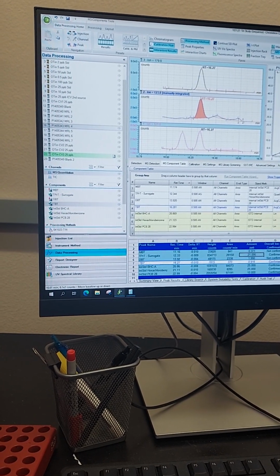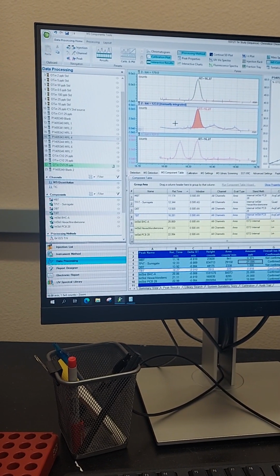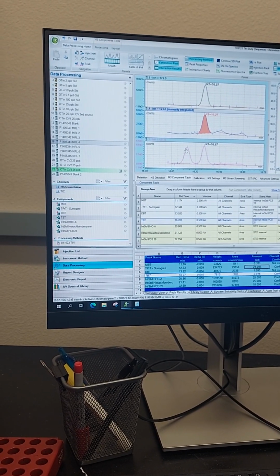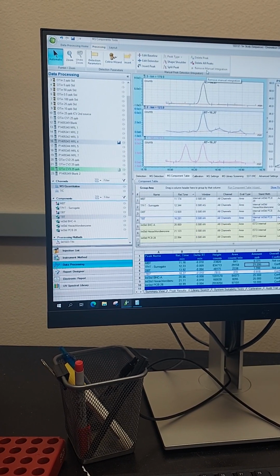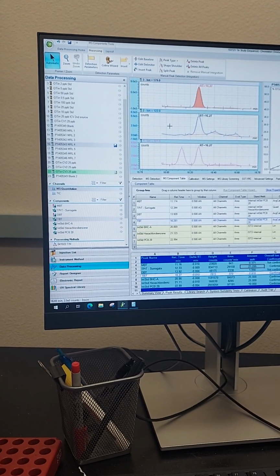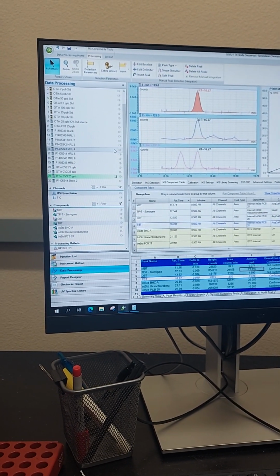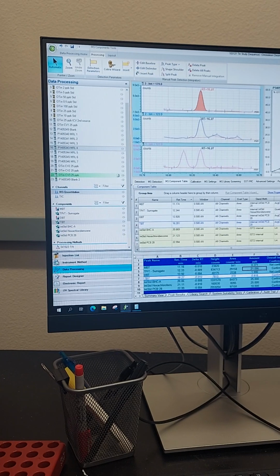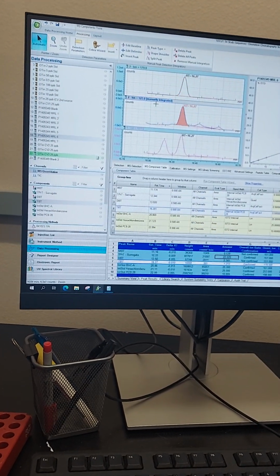I think some of these. Okay, yeah. You did some? I did some before I came and got you, just to see how it was. Okay. So when you have one, how does it work to pass it to the report? So I'm going to undo my manual integration. Okay. Save. Alright, so it's passing. Why did I manually integrate? I also don't know. Okay, maybe this one needed it.